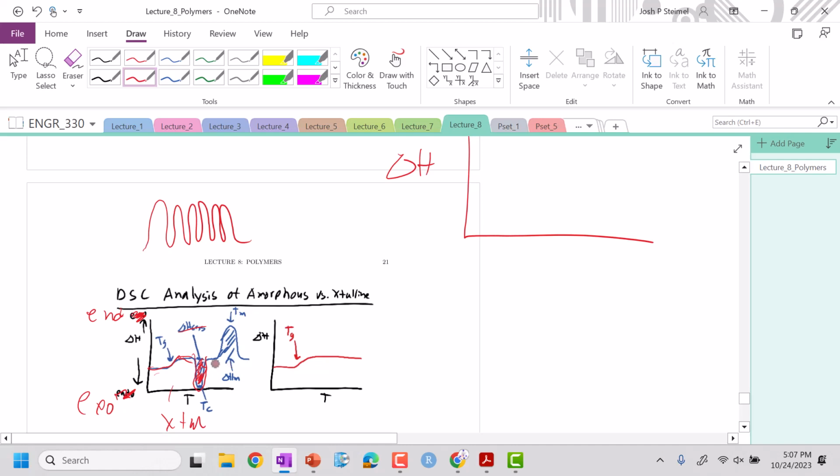But as we increase temperature again, we see our characteristic spike, our discontinuity, because this is a first derivative of Gibbs, another discussion, a first order phase transition. The glass transition is a second order thermodynamic phase transition. And we see this is our enthalpy of fusion, the energy absorbed as we go through melting.